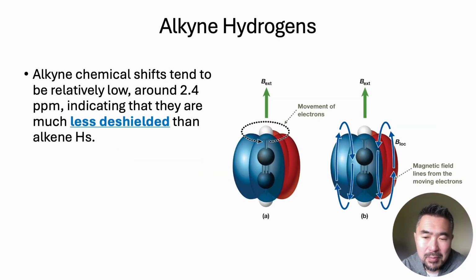That's one of the things we'll talk about, chemical shift. The shift in chemical shift is often additive. If you have so many things that would de-shield it, those effects are additive. So being part of an alkene shifts you to 5, and if being next to oxygen shifts you by another 1 ppm, then it's going to show up around 6 ppm and so forth.